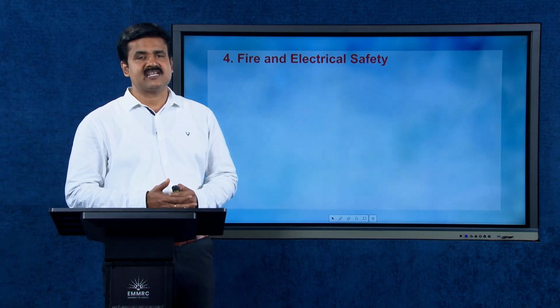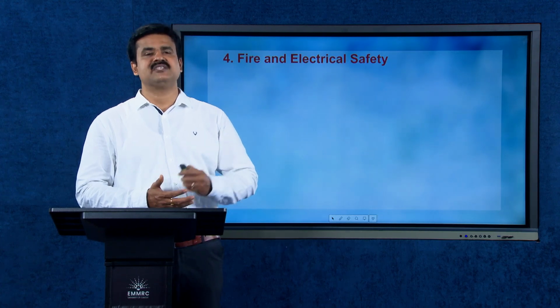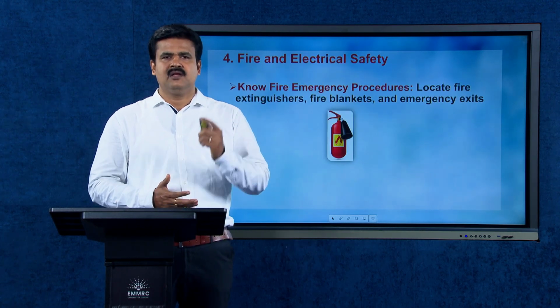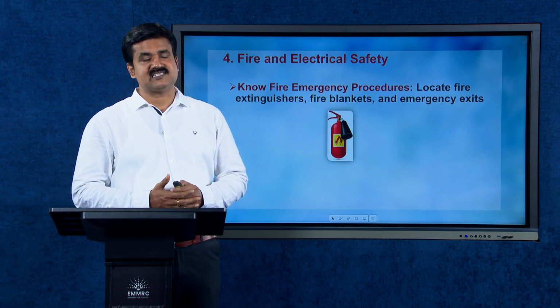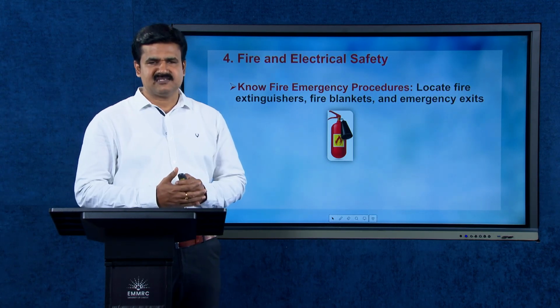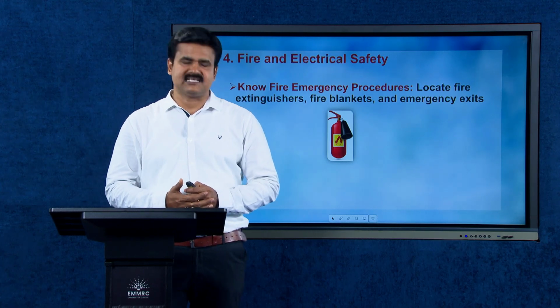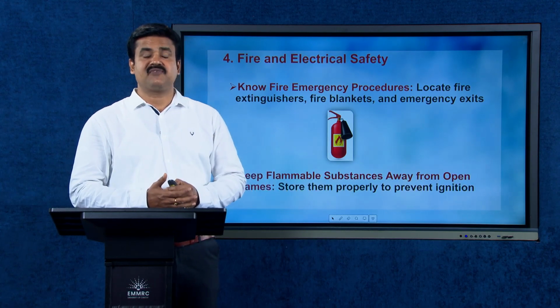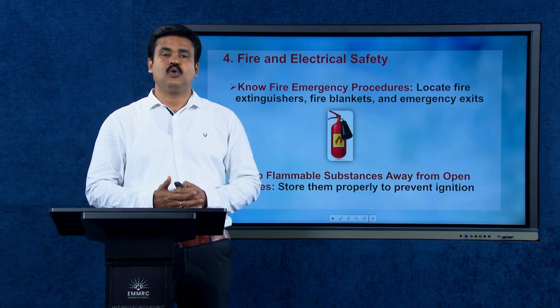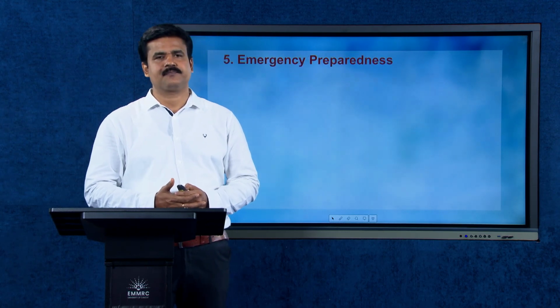Fire and electrical safety is very important as far as the safety measures are concerned. Knowing fire emergency procedures is very important. Locate the position of the fire extinguishers, fire blankets and emergency exits. Keep flammable substances away from open flames. Store them properly to prevent ignition.